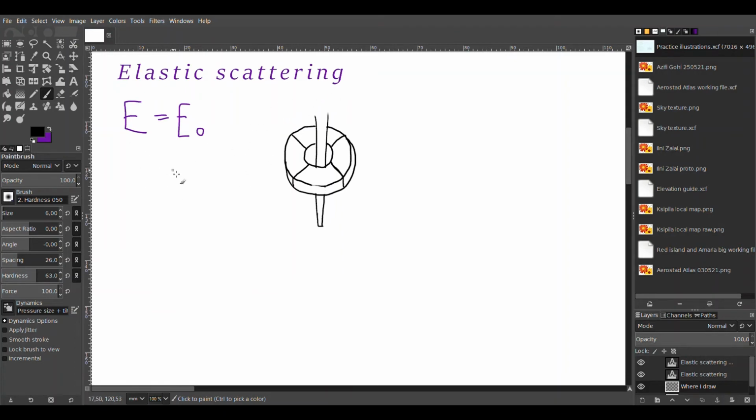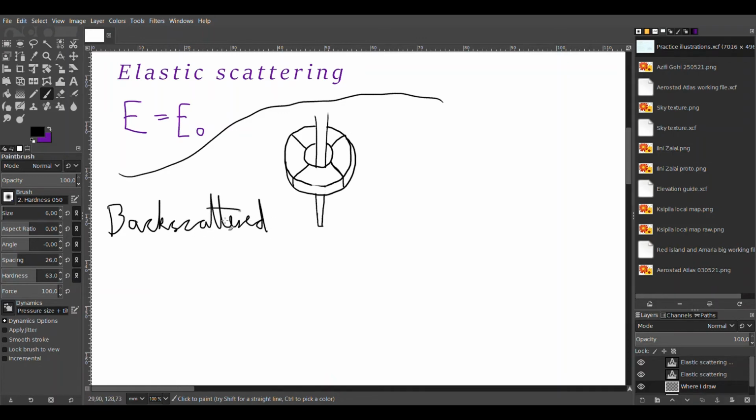So I've actually gone into something that is the main, or one of the main signals within electron scattering. Not the only one, but something that is called backscattered electrons. Or maybe you can call them, yeah. So these have got the hilarious acronym BS.